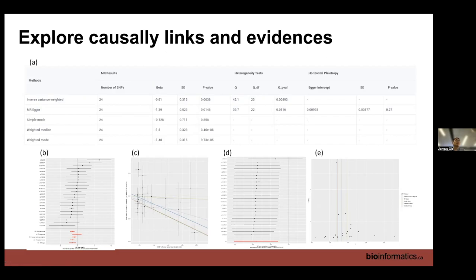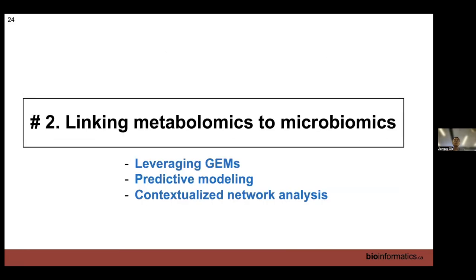So overall, if you are looking into the SNPs and metabolites and the disease, this allows you to really go through it and focus on the evidence, focus on going deeper. The table I showed is our earliest summary, but if you're looking for individual ones, you can go very deep and click to see which studies give this evidence, what you find, how big the population is. And in human studies, you really need to match the population. Asian, African, European, North American, they have different backgrounds, and sometimes that will make a difference. So that's SNPs with metabolomics.